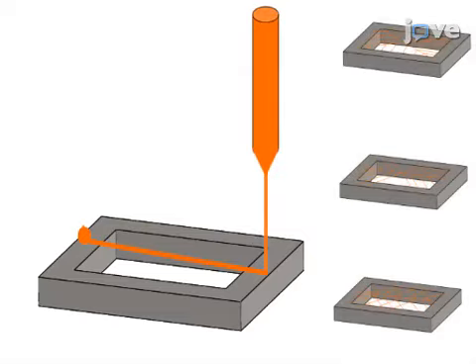fibers and web-like designs. The primary advantage of this technique over others such as wet, dry, and electrospinning is that we can precisely control the fiber diameter and the fiber orientation and dimension in all 3 spatial dimensions.